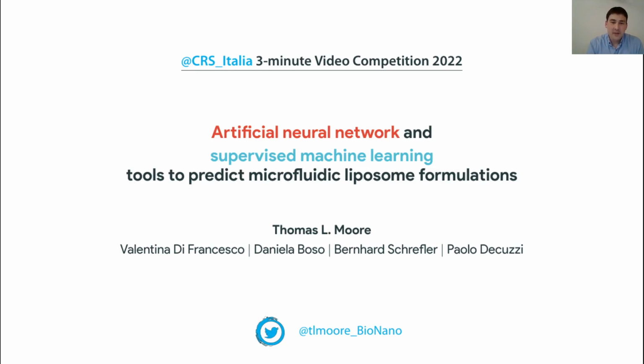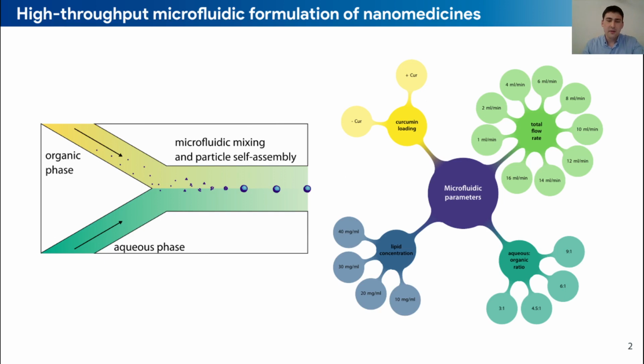I'm really excited to offer you a sneak peek into our work using artificial intelligence tools for liposome formulation development that we'll be presenting at the Controlled Release Society annual meeting in Montreal this July as part of the CRS Italia 3-minute video competition. So microfluidics offers a way to have continuous high-throughput synthesis of nanoparticles, in our case liposomes.